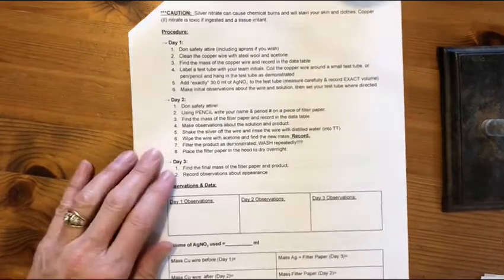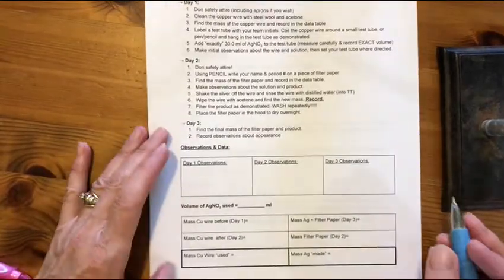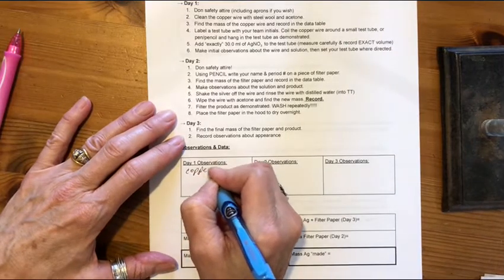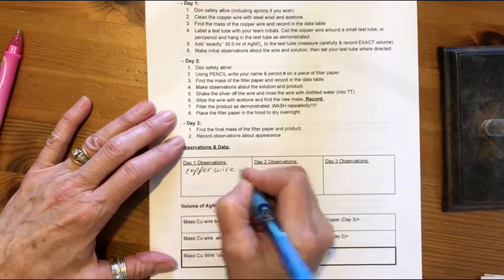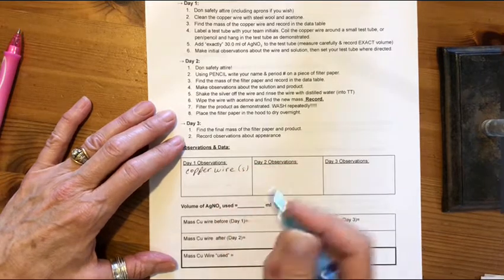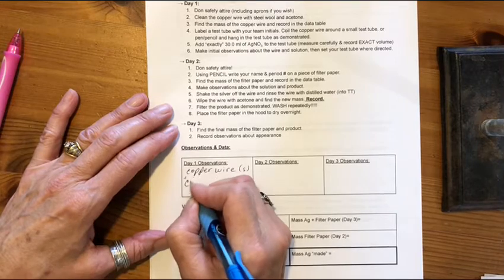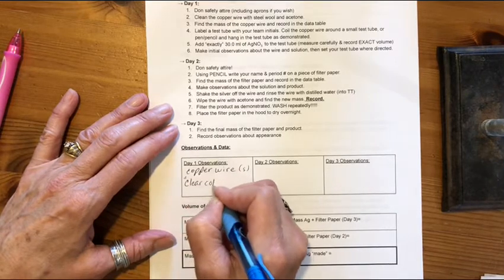All right, so this is the instructions for the lab you didn't do. If you watched the other video, which a lot of you haven't, you saw copper wire, which is copper colored, of course, and solid. And you also saw a clear, colorless liquid.